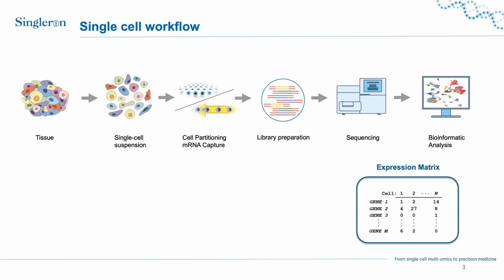But today, my topic is applications of single-cell sequencing beyond the standard RNA profiling experiment.